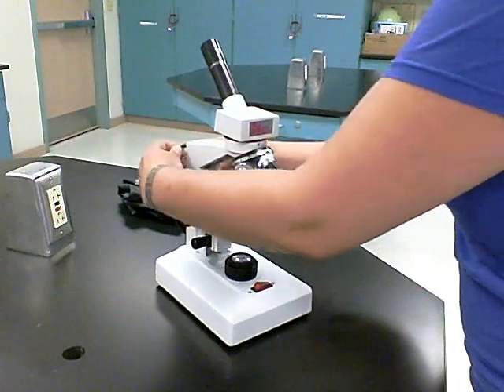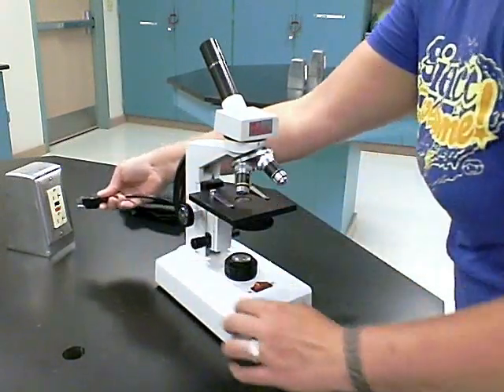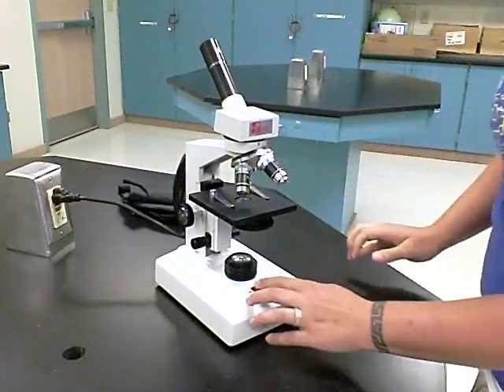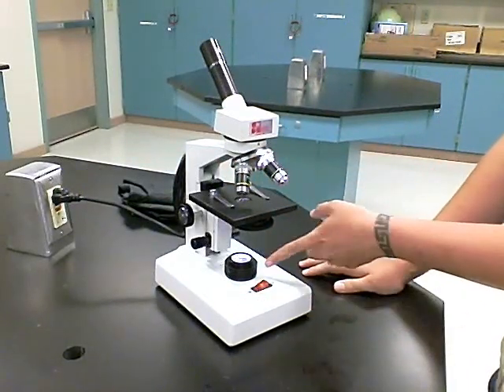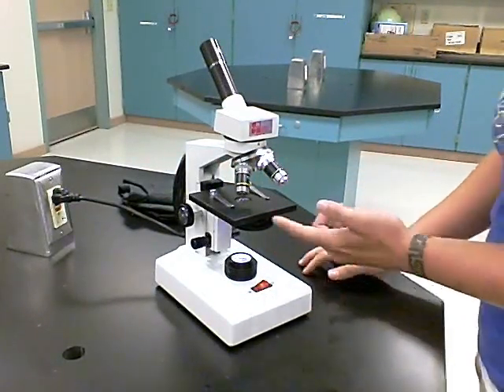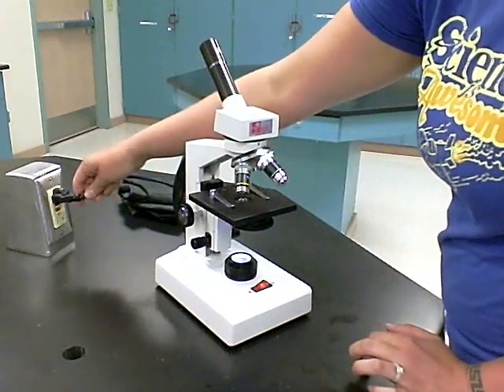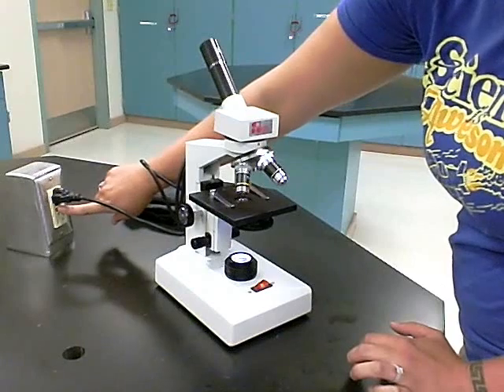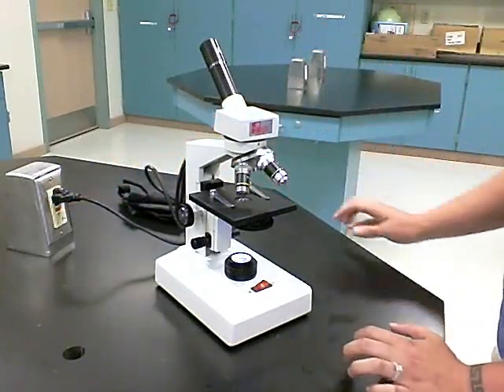To turn on the microscope, you need to take the power cord and, of course, plug it into the outlet. And you need to have it associated the right way. And then you hit the on switch. The light source will take a second to come on. Now, if you hear a popping sound, then that means that this has been tripped and you need to press the red button to reset it.